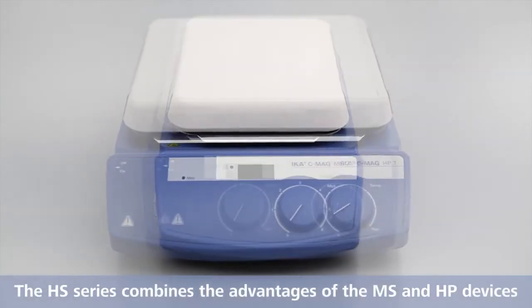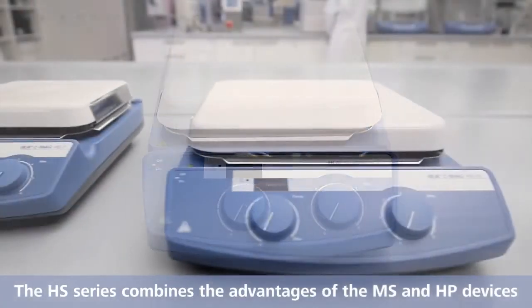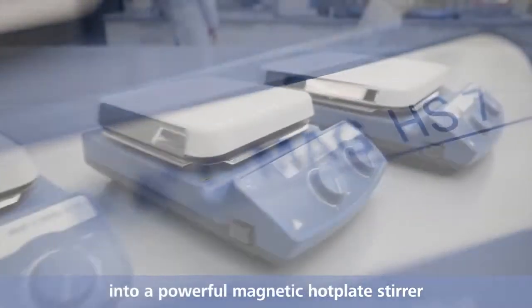Hot surface warning remains illuminated even after device is turned off. The HS series combines the advantages of the MS and HP devices into a powerful magnetic hot plate stirrer.